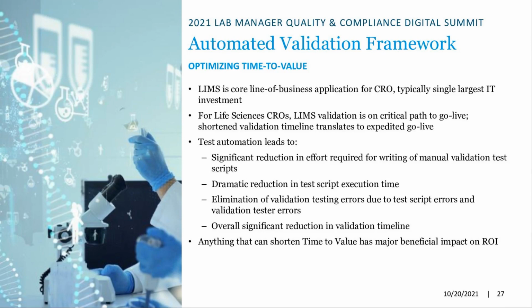and then if you get an unexpected result during that testing, you have to halt the testing. You have to do an assessment of what went wrong. And as I mentioned before, I would say 90% of the errors that we would run into in validation testing were either due to an error in the way the test script was written, and you look at it and you're like, oh yeah, I followed that step, but when I do that, it leads to this error, and then you realize the script was missing a step that should have been there.